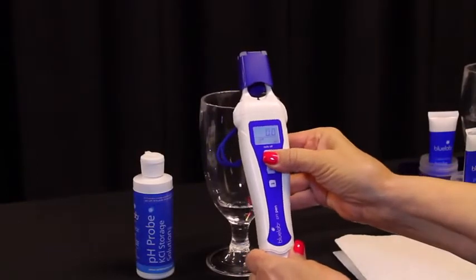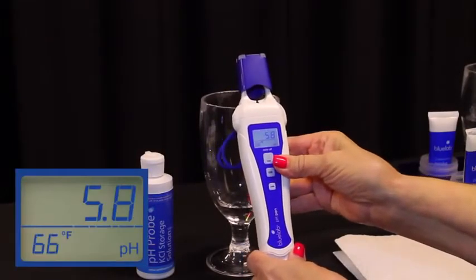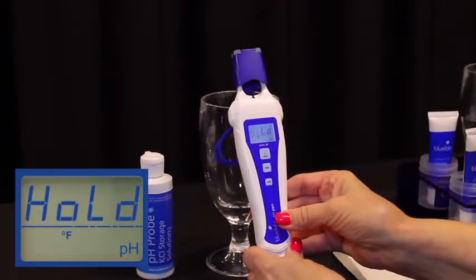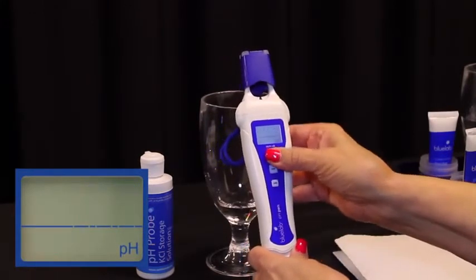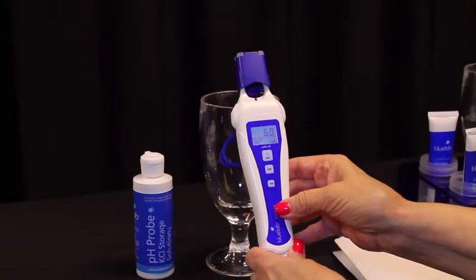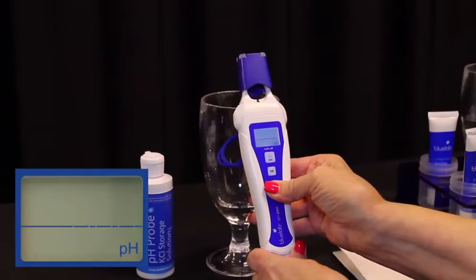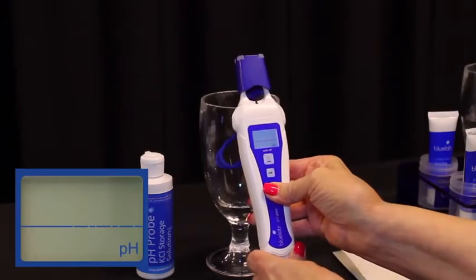Press the power button to turn on. This pen is backlit and has a hold feature for easy reading. One short press of the on/off button to make it hold, and once again to turn it off. You can change Celsius to Fahrenheit by holding the units button down until it starts to flash, then press again to change.